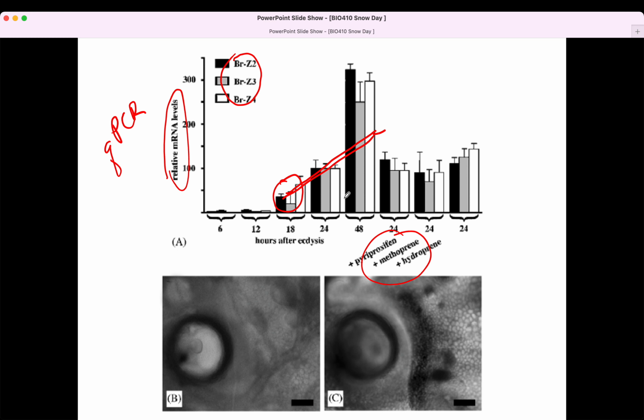And this is the data that I'll repeat with the CHINMO samples we've collected, and lots more of them. And we think we'll see CHINMO expression here and then go down. So as CHINMO goes down, we're predicting we'll see BR going up, and we have our first hint of that already with your results. This is one of those in situ hybridizations with BR, showing the RNA in the tissue, and you can see the dark RNA in this case.